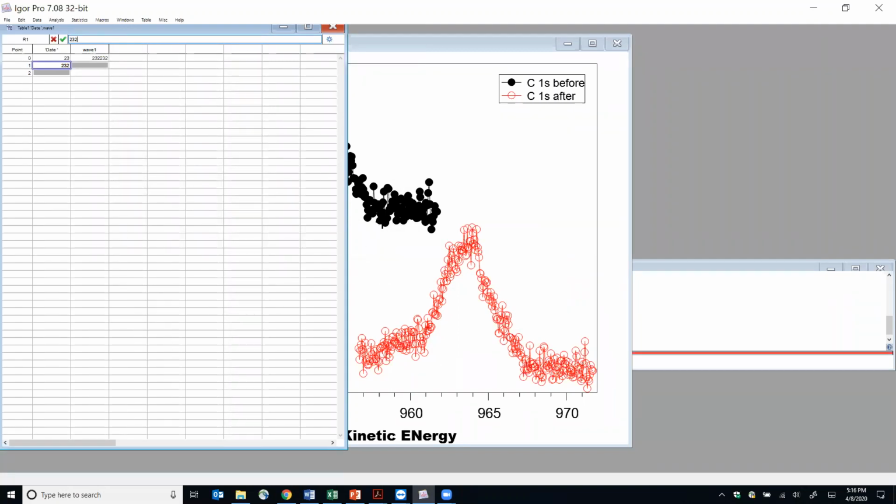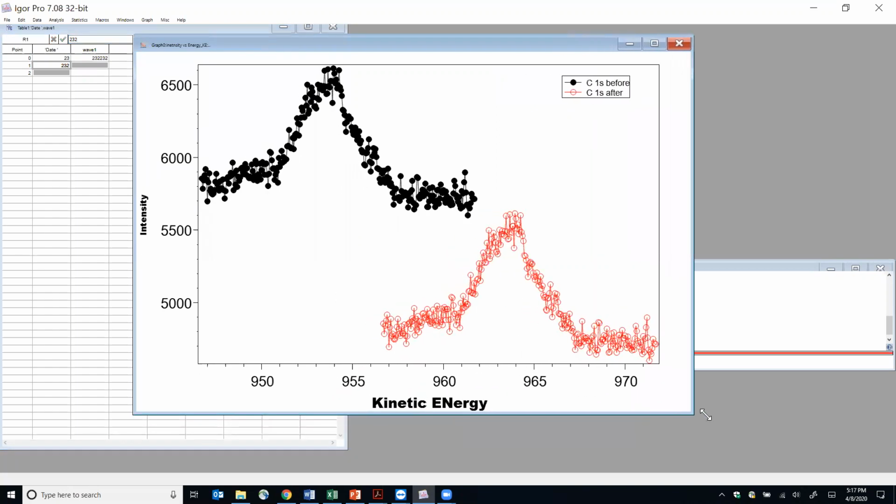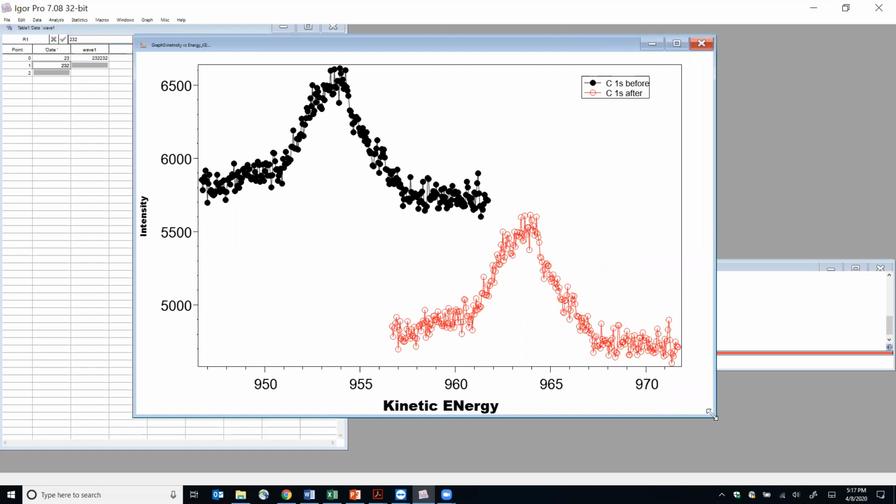Now I will send you some tables. I need to export them because they are still in the system. To export them to a text file or Excel file, and you can just load them and plot them. Do you have any preferred style or no?